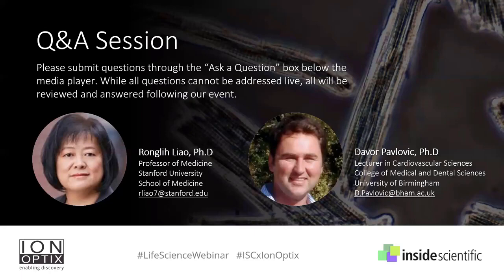I would probably just add, whatever collagenase you choose to use, make sure that you test it out in your system quite well. What we often tend to do is buy several different batches of collagenases and then test out which concentration works best with that particular batch. And once we've identified that, we buy a lot of that batch, freeze it, and just keep using it for the next year or so. So the batch number of the collagenase is quite important. Don't expect to just buy a new collagenase and have it work in exactly the same way that it did before. This applies to both the Langendorff and the injection method, I would say.